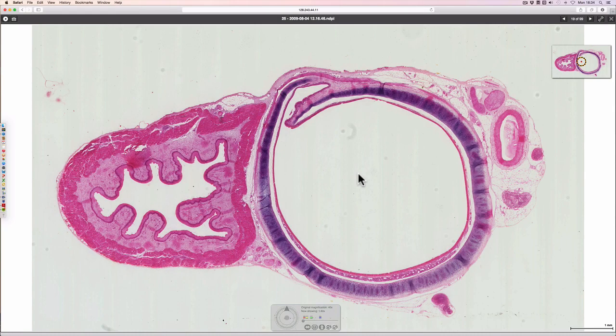This video is going to concentrate on looking at the structure of the respiratory epithelium and the layers of the respiratory tract.